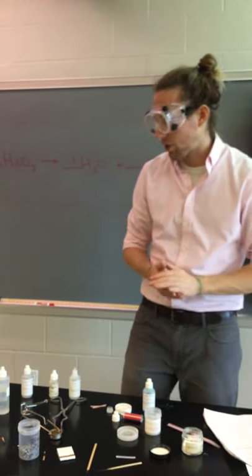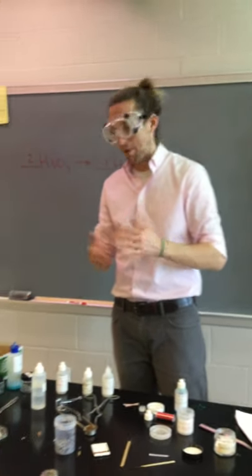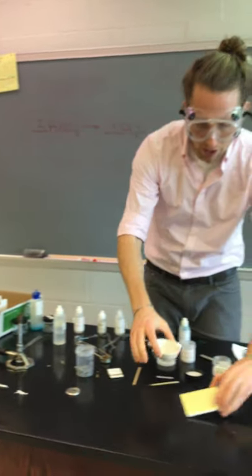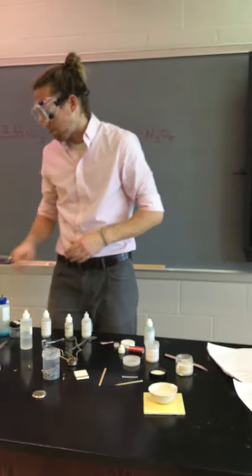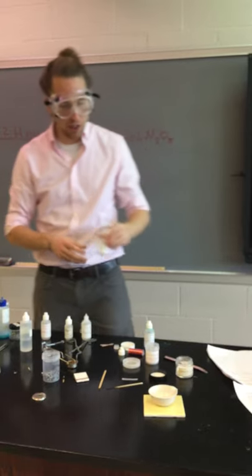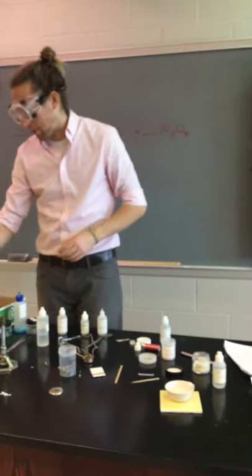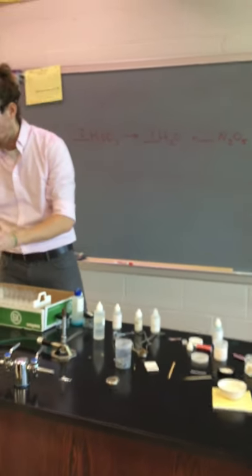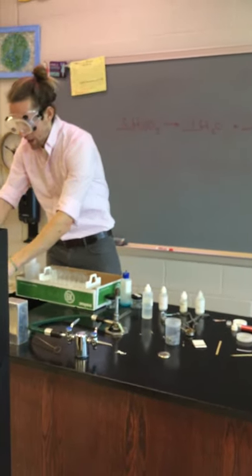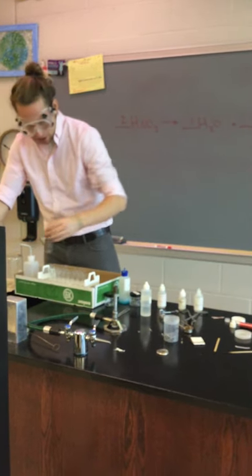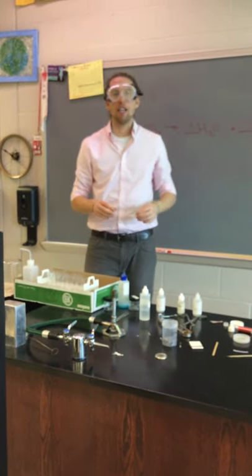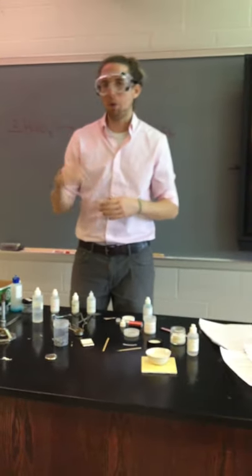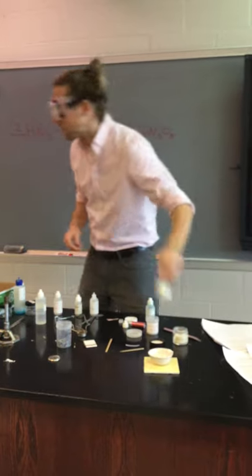Now, our final reaction is going to require a little bit more flame. So we are going to get an evaporating dish. Here is our evaporating dish. We're going to put it on something to protect the countertop. And into the evaporating dish in a moment, we are going to add ethanol. Ethanol is a flammable alcohol. Now, before we begin, I'm going to get a test tube set up with cold water. And the cold water is going to allow us to see if anything is coming off of this reaction when it occurs. So we're going to actually see the presence of a gas, hopefully, by condensing it on that test tube. Now, again, we want to turn the lights out so you guys can see this better.